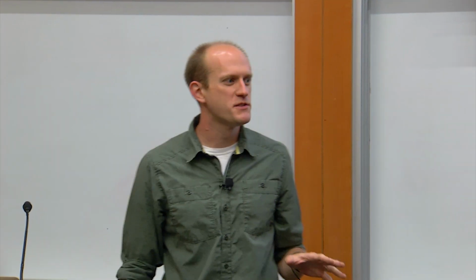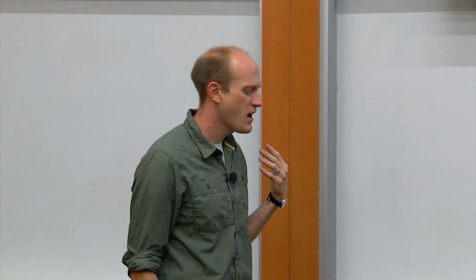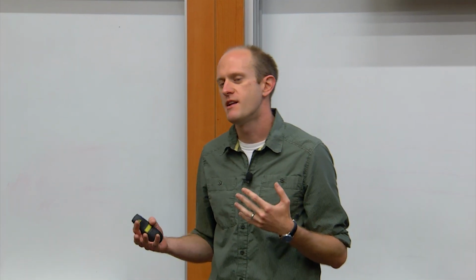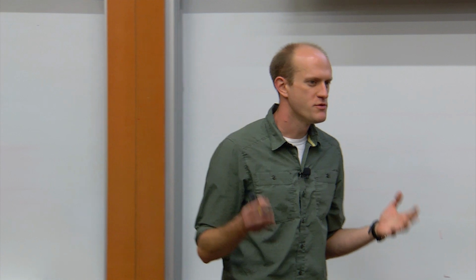Bright and early, and now we're going to talk about bioinformatics, which normally might be a recipe to fall asleep, but I'm going to keep this practical, right? I'm going to talk a little bit about how some of the tools work, but I'm going to try to frame this in terms of what would you want to do, why would you want to do it, and really importantly, not just use tools blindly, but understand what the output really means, right?